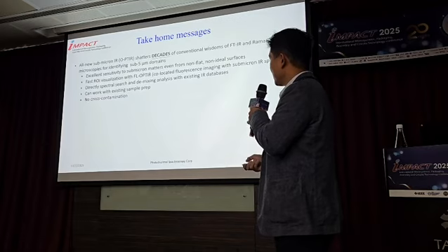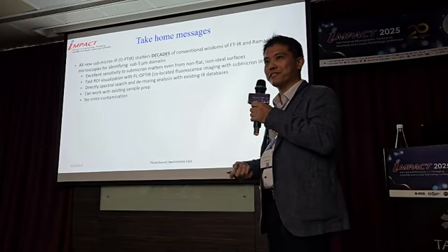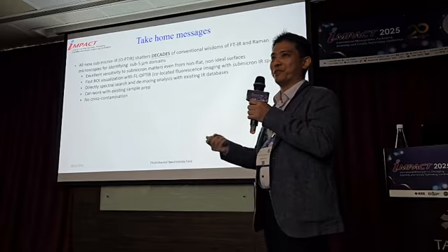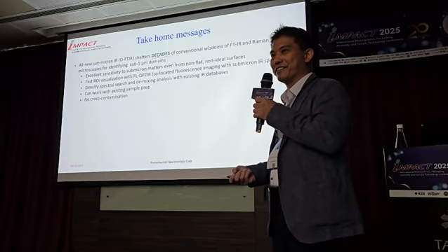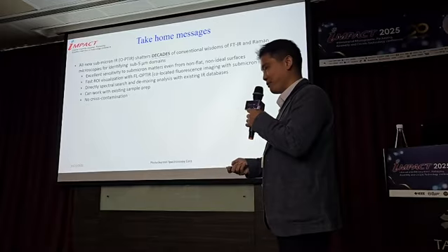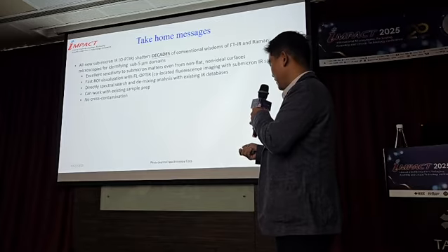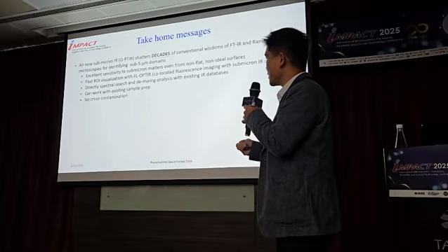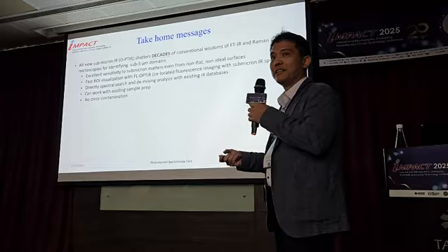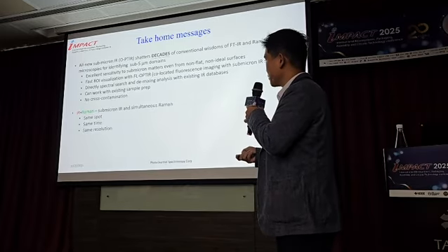And finally, I hope that I have shattered your common belief of the past 50 years or so that IR doesn't really work. It actually does. It's just that we have to change the way that we detect the IR signature, and we are able to achieve that with O-PTIR. So we now have excellent sensitivity, and we can combine it with fluorescence, FL-O-PTIR, to achieve quick identification. And finally, we don't have to worry about cross-contamination.